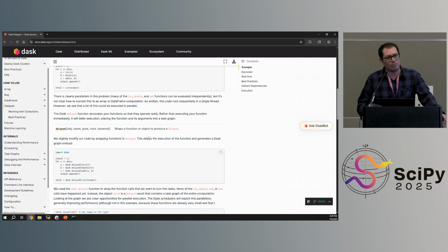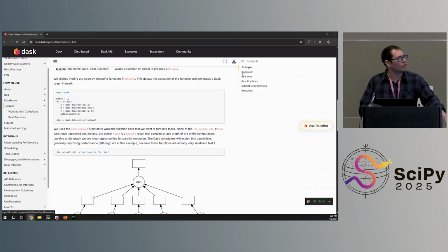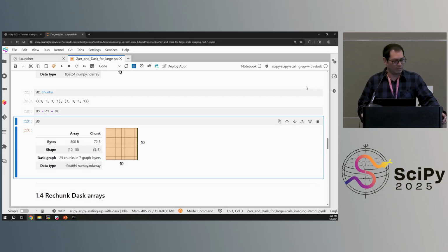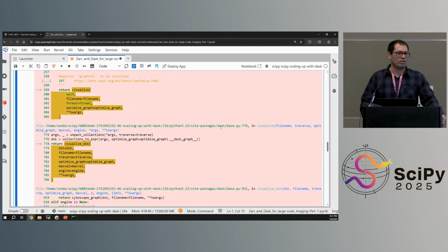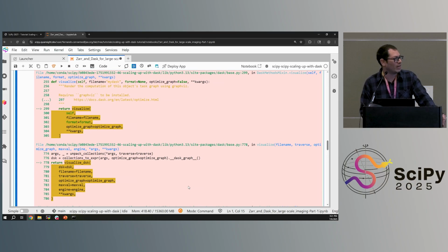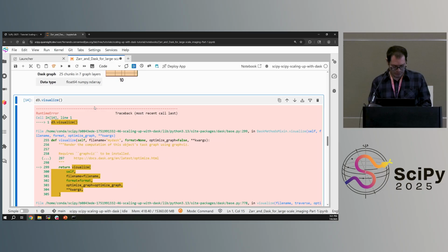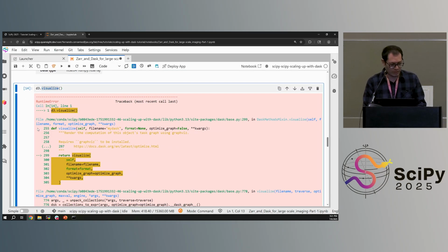So there is a nice integration between Zarr and Dask that streamlines the chunking that you already have when converting into this file format. So you can think that, going back here, those small tiles are something that have been already converted using this conversion into the next generation file formats. So there are some steps that you don't have to handle, because that would be a more standardized process where you convert your image into these kinds of file formats, and then you can apply any inference pipeline using Dask to parallelize that. So this is the motivation of this tutorial.